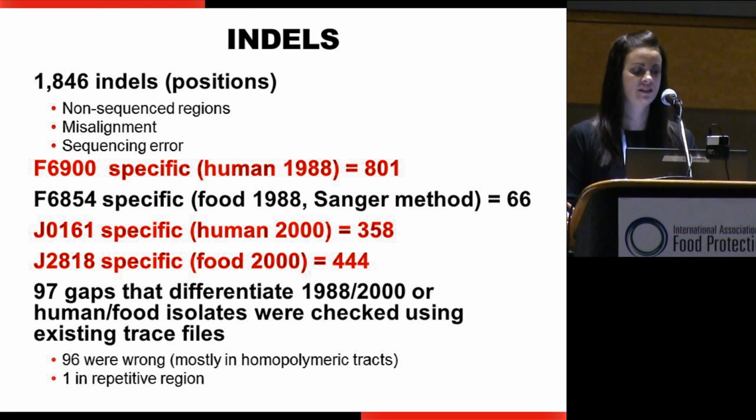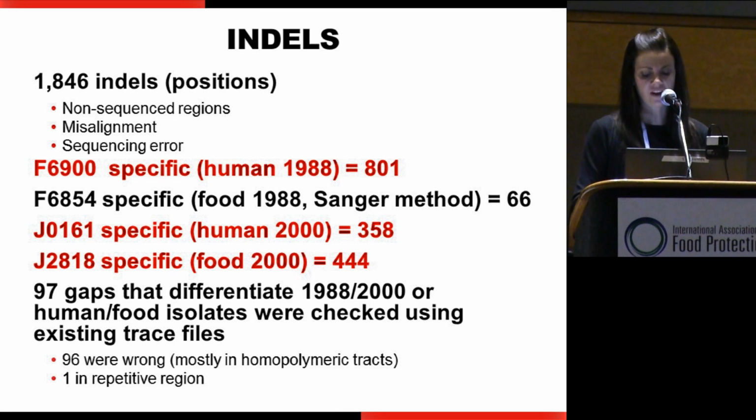So looking at this actual sequence information, there were a lot of indels. Indels are short for either insertion or deletion mutations. And as I mentioned earlier, most of these actually were identified to be an artifact of the sequencing technology, and they weren't actual mutations.